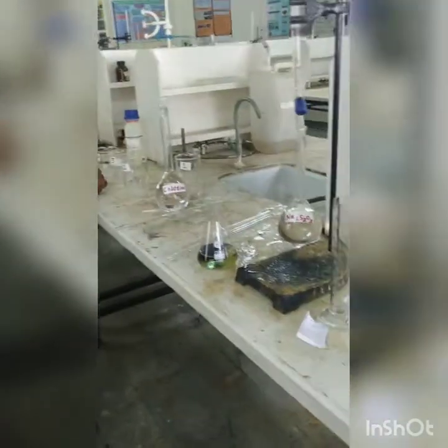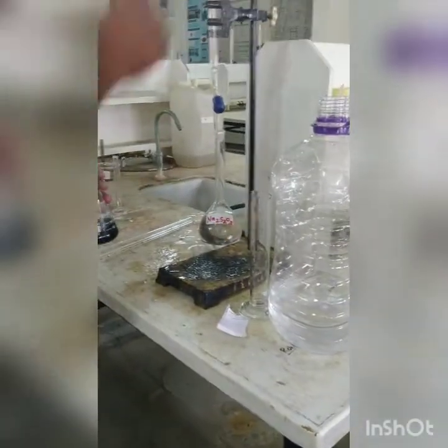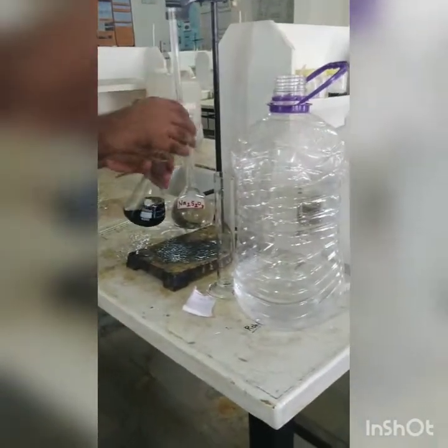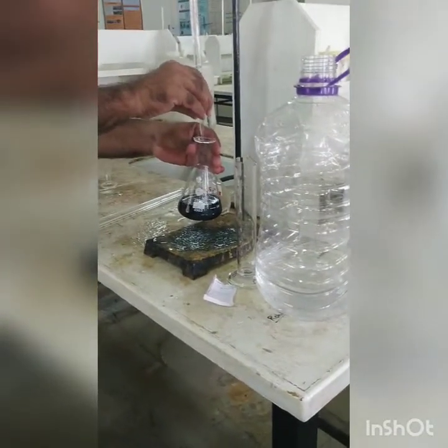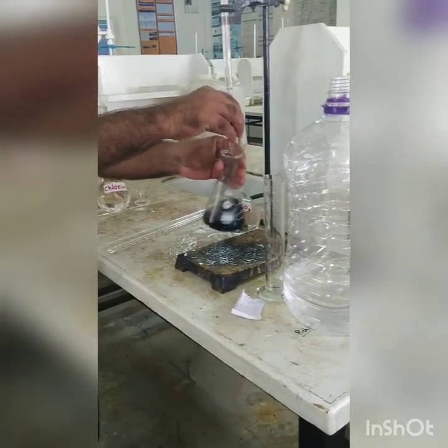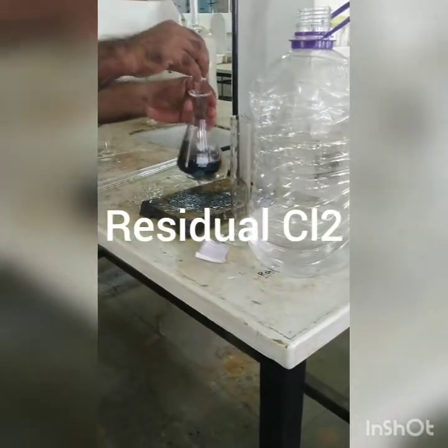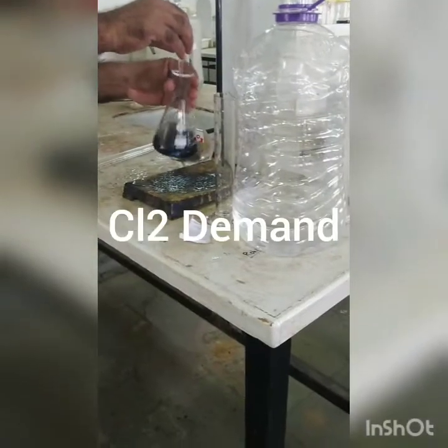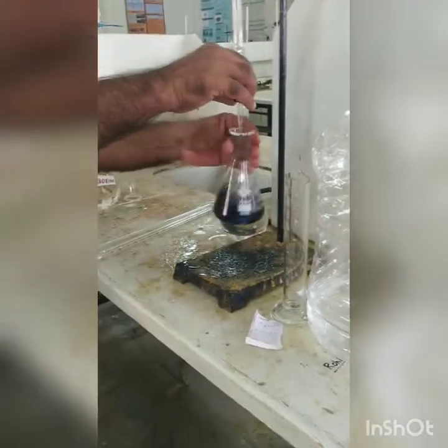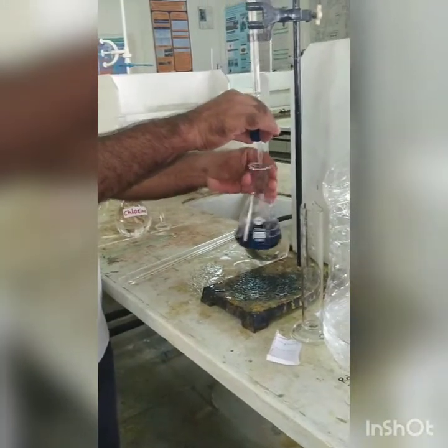So the blue color has developed. Now titrate it against the already standardized sodium thiosulfate, and we have to record the amount of titrant in mL as, say, Y mL, till the first disappearance of blue color. This will be made use of in calculating the concentration of chlorine.